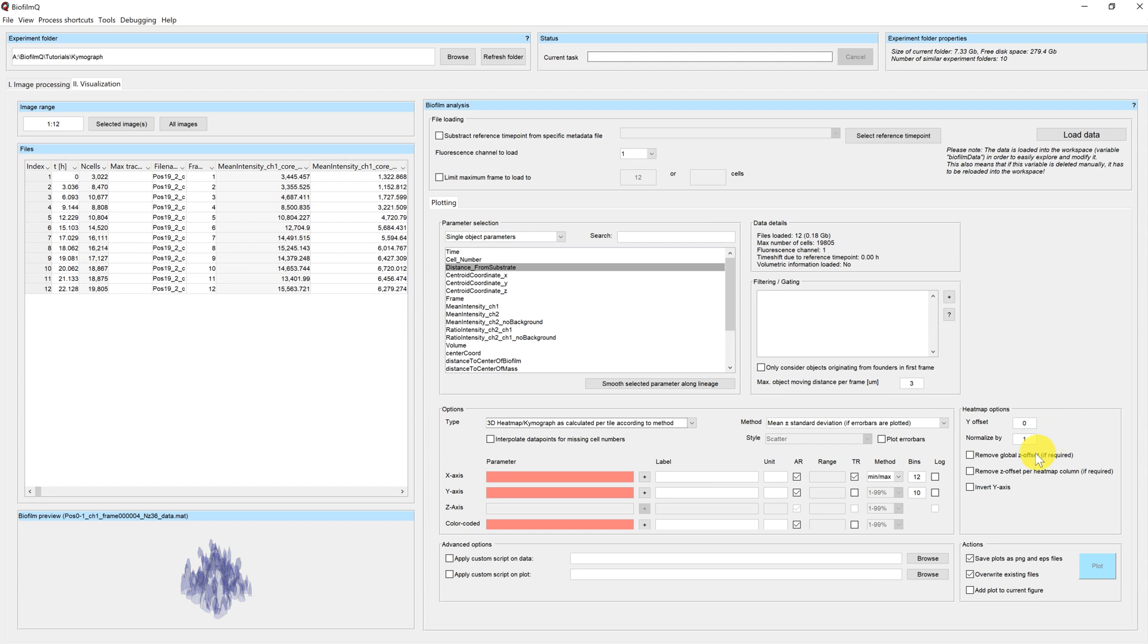Removing a global or local offset, which works in the case that you use distance to substrate as a spatial measure. And you can also invert the y-axis.